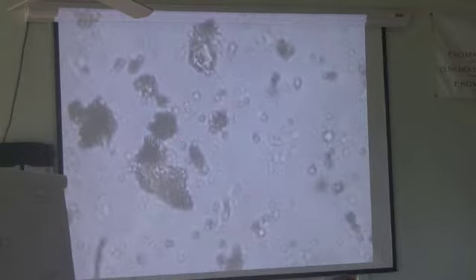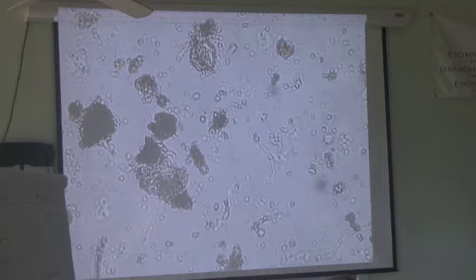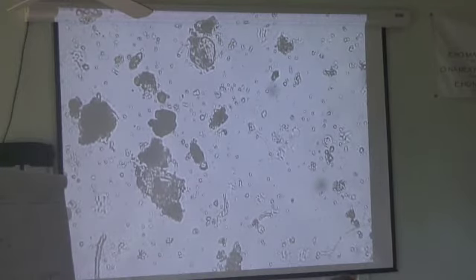So lots of things jiggling. So there was a flagellate. We got one, two, there's another flagellate. We got two actinos in here. They would count this as just a piece of stuff. See how it's kind of lumpy and bumpy? There was another flagellate. The flagellates tend to be smaller than ciliates, but there are some very small ciliates, and there are some very large flagellates. So you really do want to be looking for that motion. You want to be looking for the wall. Still no fungi. We haven't picked up any fungi at all.